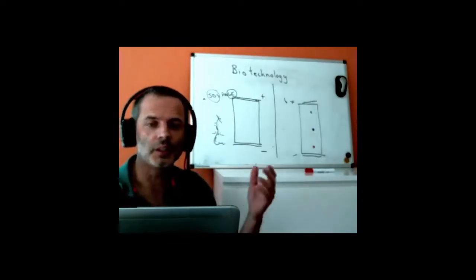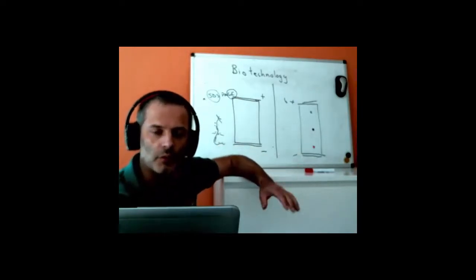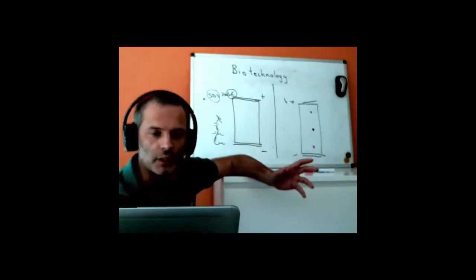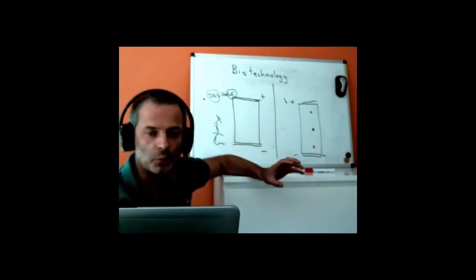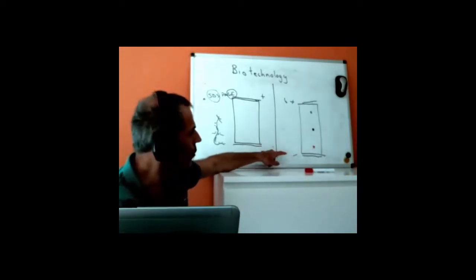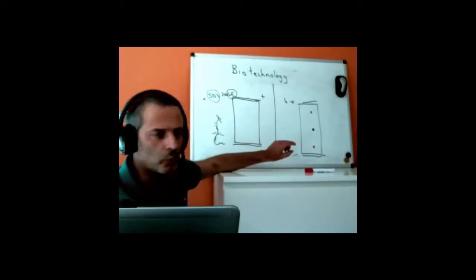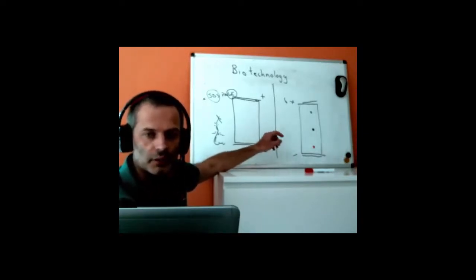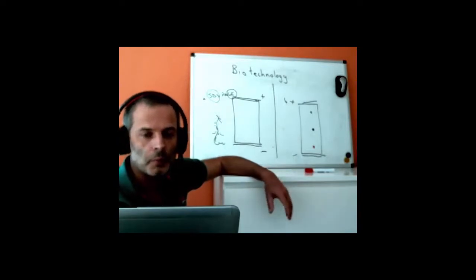The other possibility is even more awesome. What we can do here is we leave the protein as it is, and we're interested in the pH at which it has zero charge. So instead of having a strong buffer inside our gel, we have a much weaker buffer solution, and we set up a pH gradient that is made up almost automatically from the current that flows. It's much better if you make it beforehand, but it will automatically generate a pH gradient over time. So we have at the negative end a high pH and at the positive end a low pH.